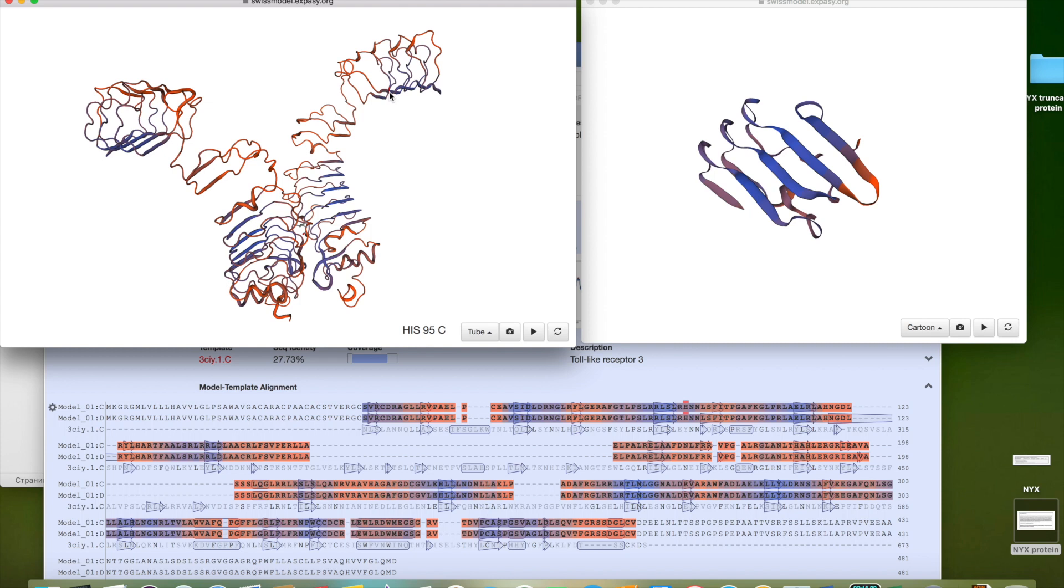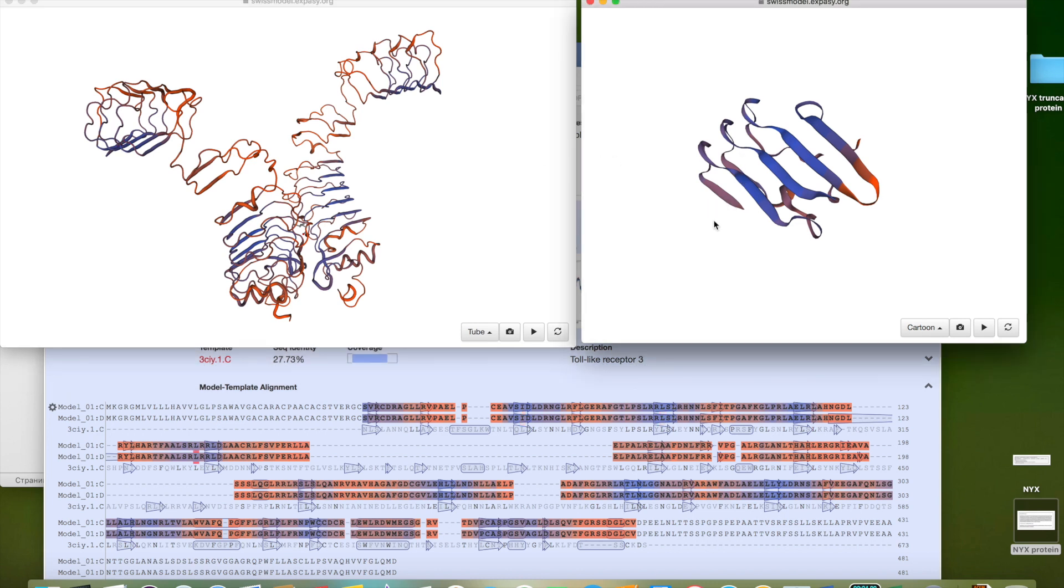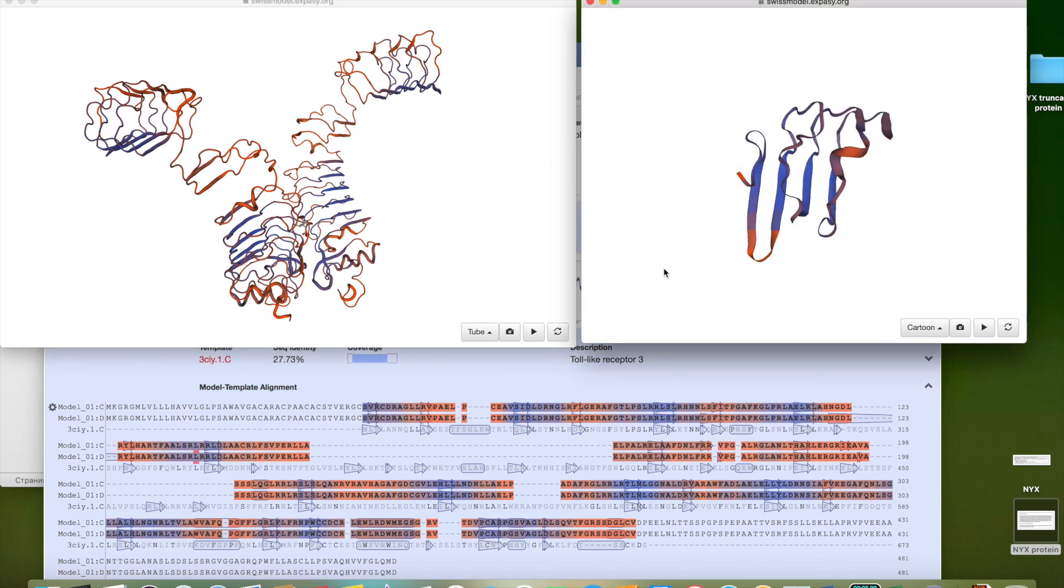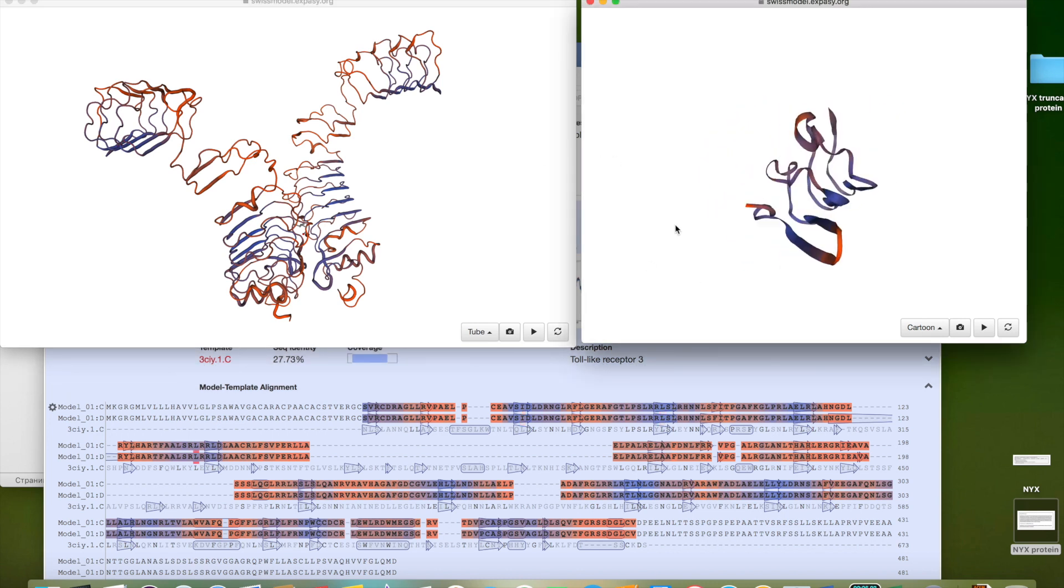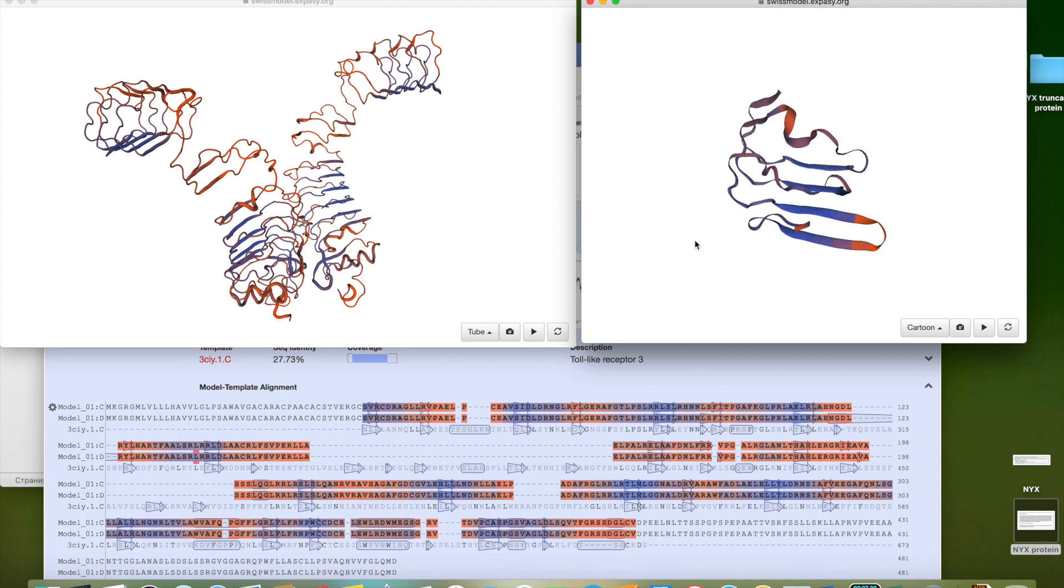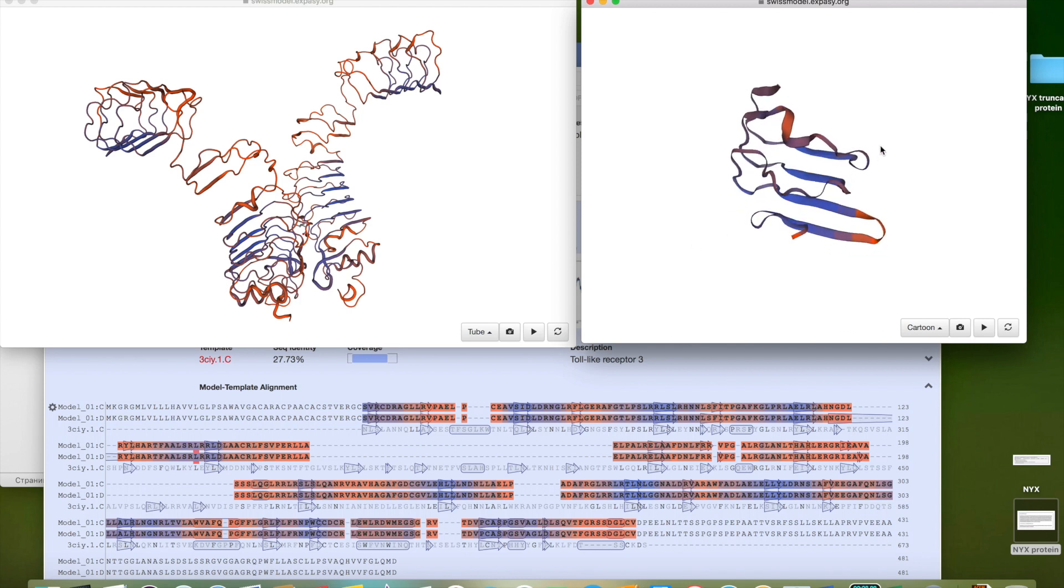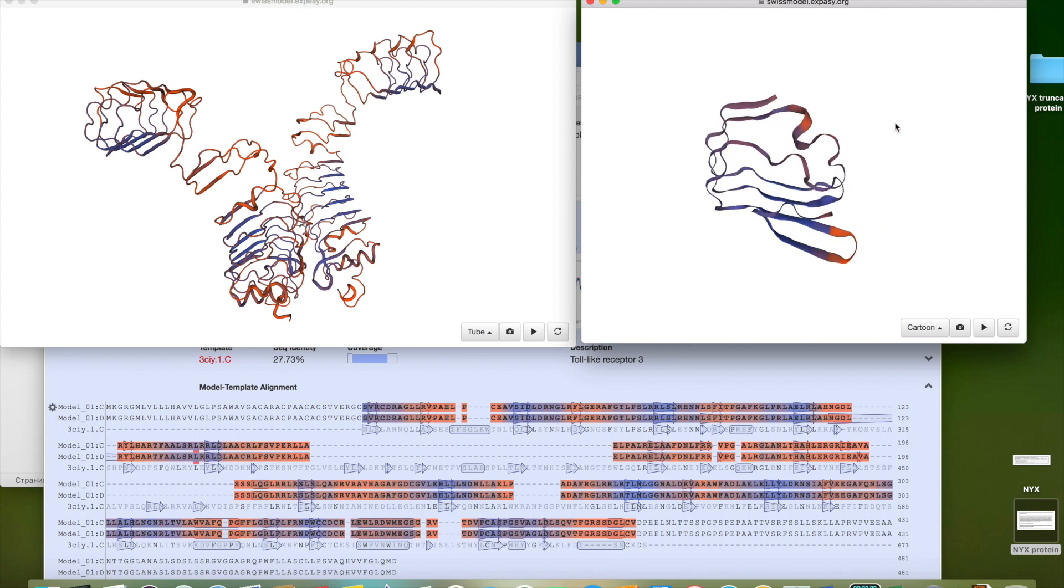Okay, so let's see how it looks like this one. And let's see the structure.